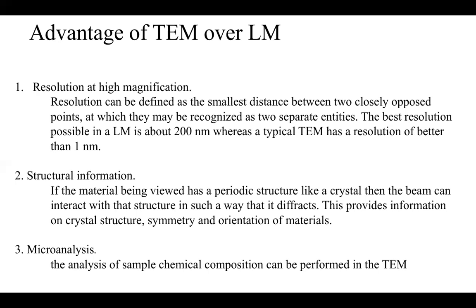And with TEM, you can get structural information easily. If the material being viewed has a periodic structure like a crystal, you know, in a crystal the atoms are arranged in a periodic manner. Then the electron beam can interact with that crystal plane structure. Normally the interplanar distance is around a few angstroms.